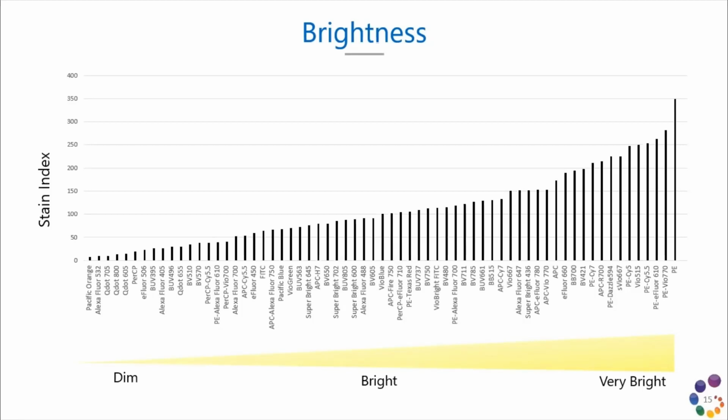When you start thinking about how you want to pair each of your dyes with your antigens, you need to refer back to how you classified each antigen as primary, secondary, or tertiary. When pairing the tertiary antigens, you want to use the brightest dyes you have for these, so you have the highest chance of detecting them in your panel. For the secondary and primary antigens, you can pair the medium-bright and dim dyes with these, as those antigens will be easier to resolve given their higher levels of expression compared to the tertiary antigens.